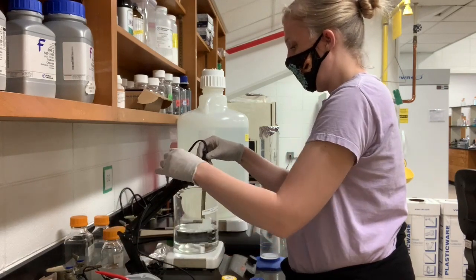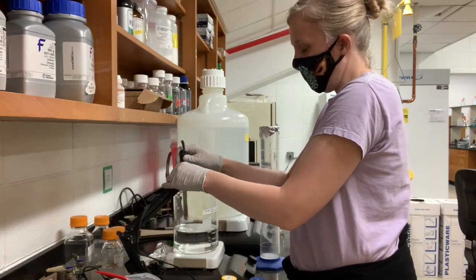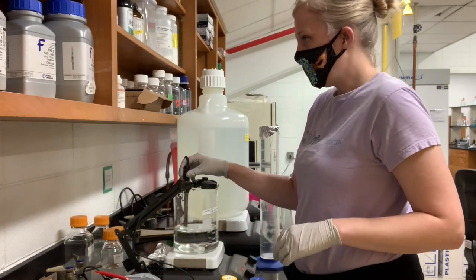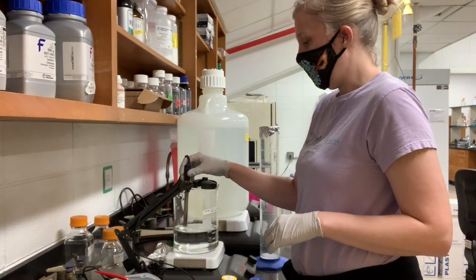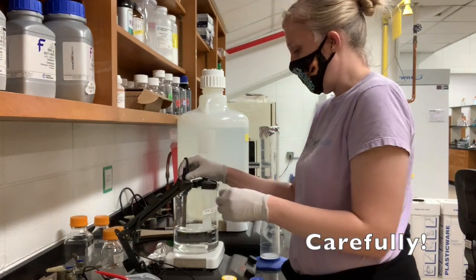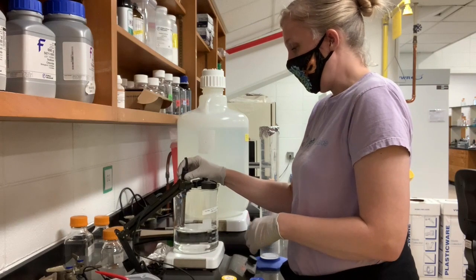And depending on how things look, like actually I'm having a hard time getting the meter into the solution. So what you can also do is just tape the meter to the edge of the beaker.